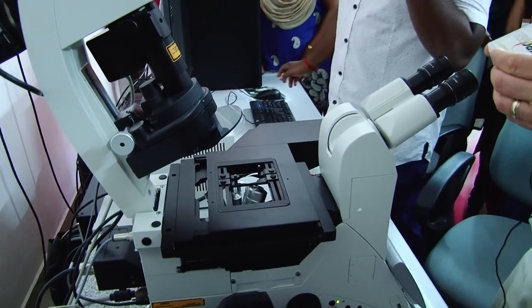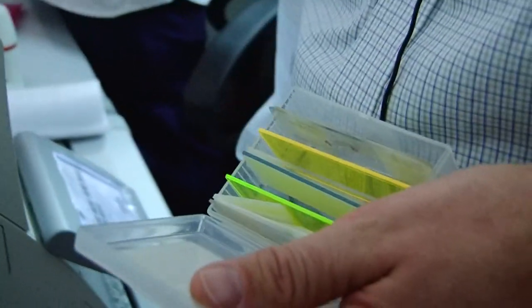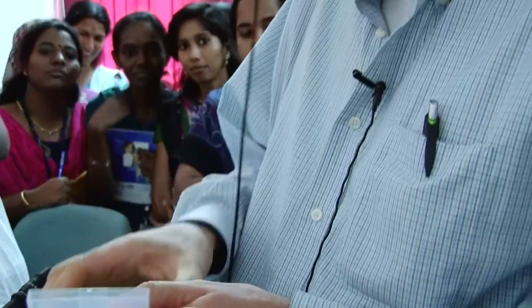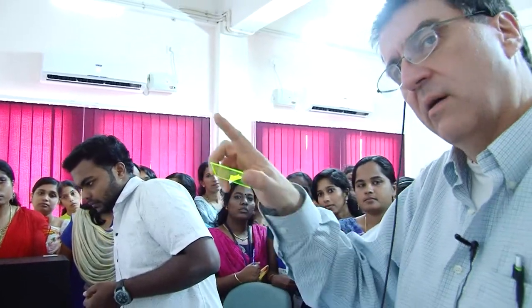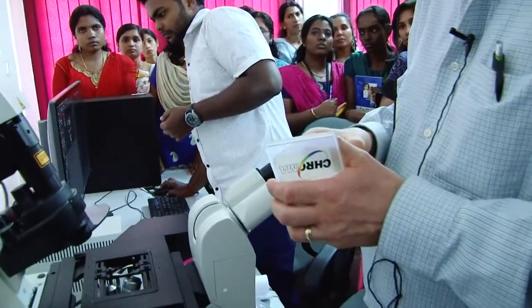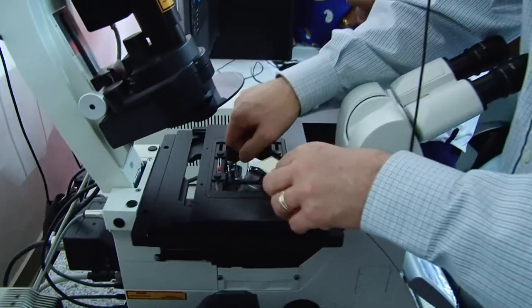I brought a slide from America, I hope it's still in here. Oh, that is a fluorescent correction slide. What I use this kind of slide for is if I think I've got an unevenness in my camera. I put up a slide like this, take a picture, and look at the gray values. Remember we talked about gray values? I want to make sure my gray values fall within a certain range to tell me that my fluorescent field is even and flat. That's what I use that for. But let's try this with the pollen grain slide.